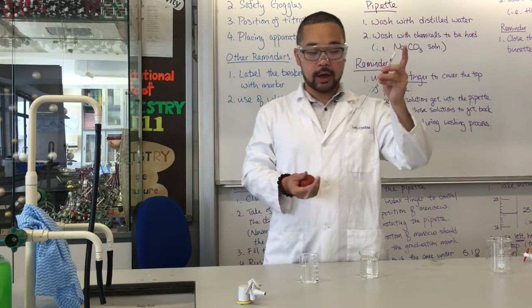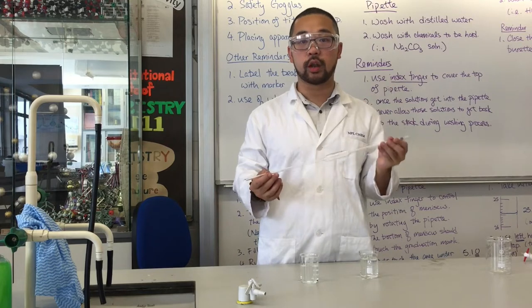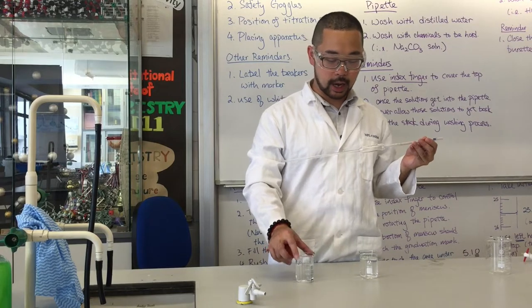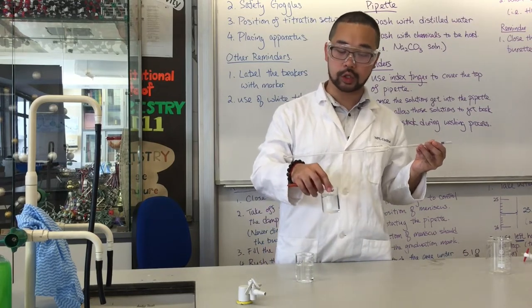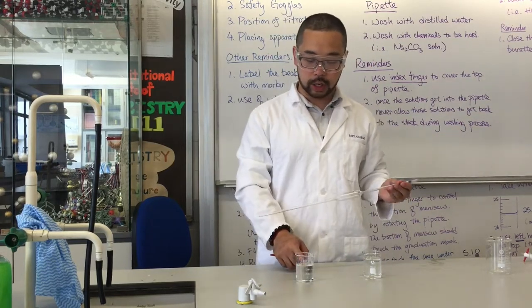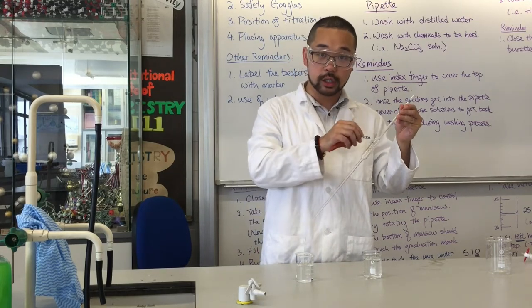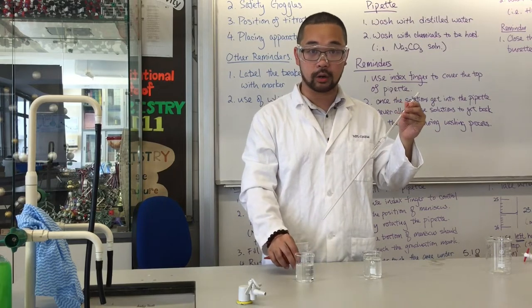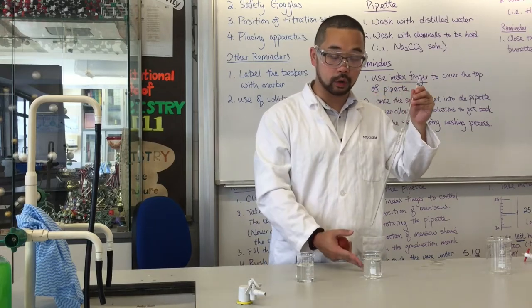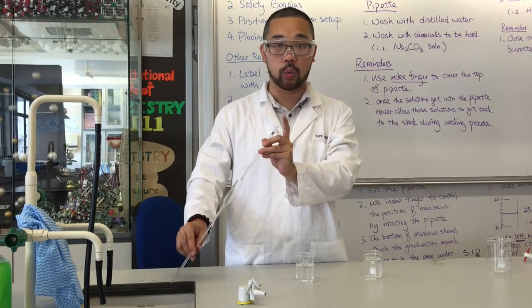Wash the apparatus. For the pipette, like what I taught you, we need two kinds of chemicals to wash it. First of all, we need to use water to rinse it first, and afterward, we're going to use a chemical to hold, which is sodium carbonate. So remember, during the washing process, we don't want the liquid after getting into the pipette to flow back to the stock liquid, because the dirt in the pipette may contaminate our stock. So whenever we take up the solution, whether water or sodium carbonate, we have to hold it and then put it into the sink to wash it away.